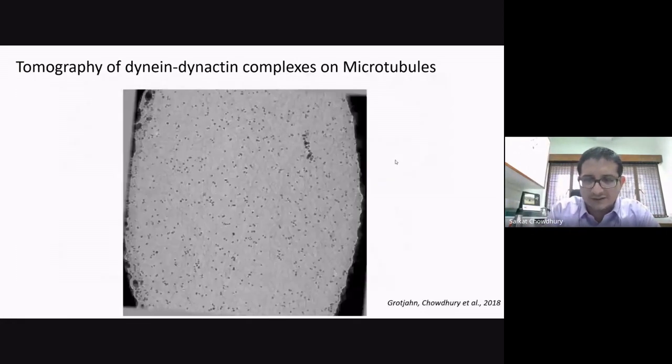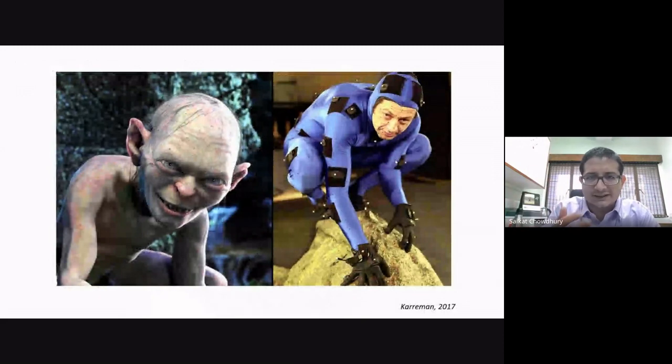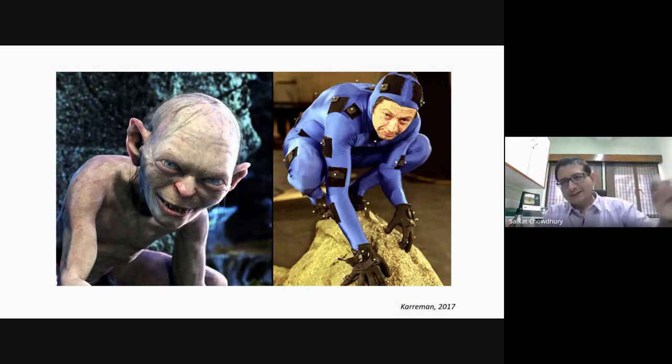They're called fiducial markers, just like you would see in the case of, essentially, Lord of the Rings. If you remember Smeagol, the actual actor did all the motions and movements, and then there are these little white beads which are traced to figure out the motion of the animated character, or basically extrapolate the motion of the character from the actual actor.